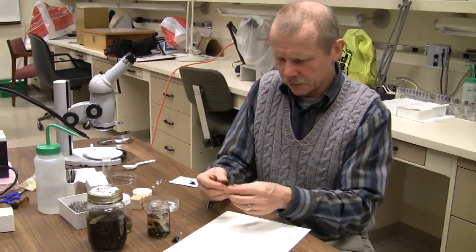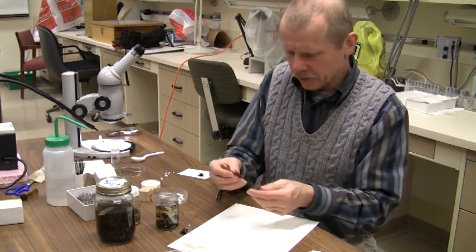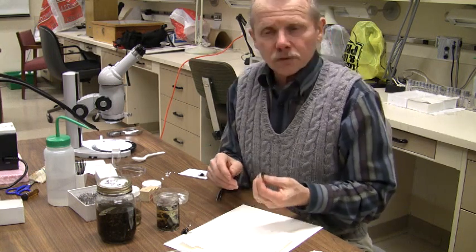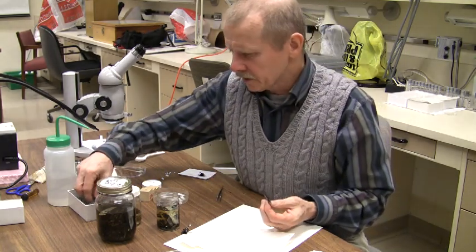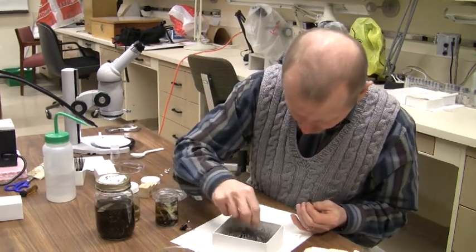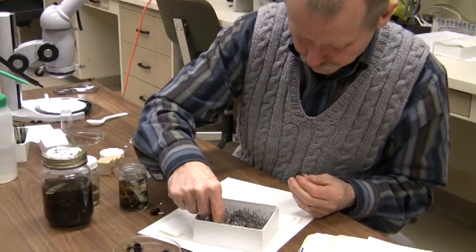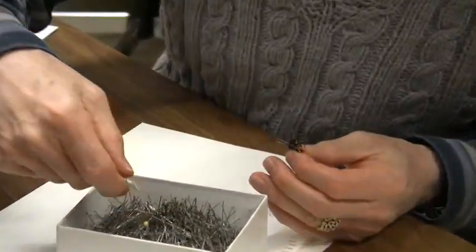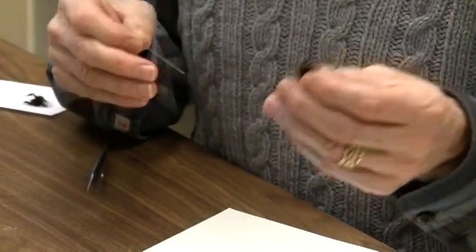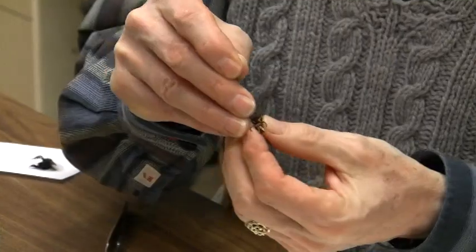We have this fairly large wasp here. How do we begin to pin it? What you can do is hold on to it to get a good grip and look at the middle part of the body. For the most part, the pins are going to go between the wings, where the wings attach to the body. Then look in the insect pin box for a fairly stout insect pin since this is a large insect. Take the pin and push it through where the wing joins the body.